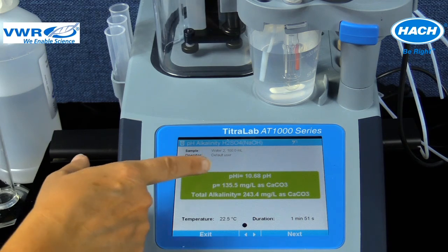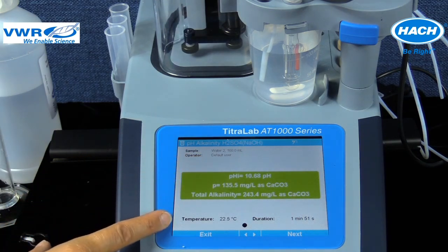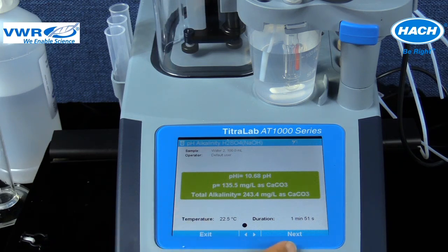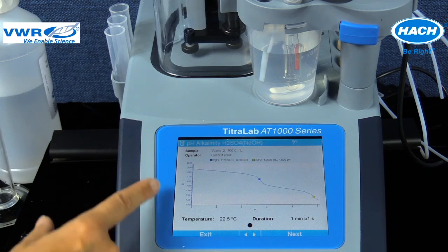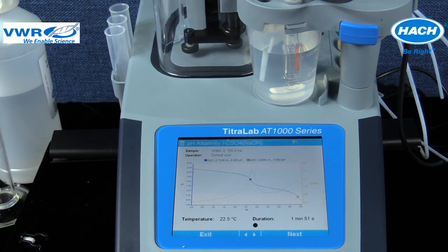The black dot at the bottom of the screen indicates that there are subsequent screens of information. By using the arrow keys on the keypad, the second screen can be displayed. In this application, the second screen displays the final curve, highlighted endpoint, titrant volume, and pH measured when the endpoint was achieved. A third screen is also available that contains the curve.